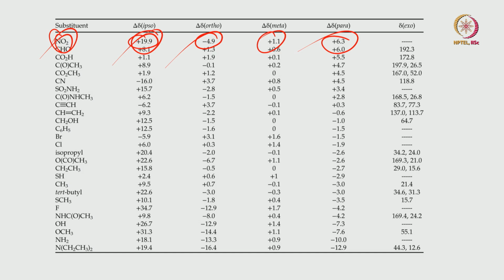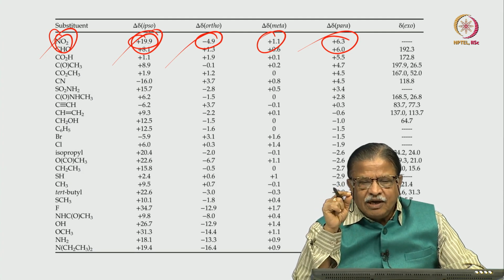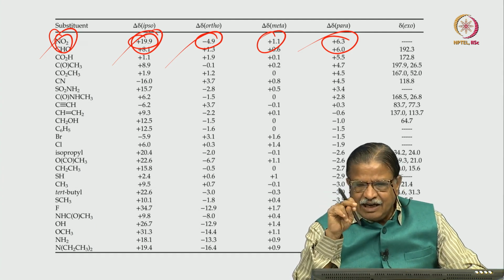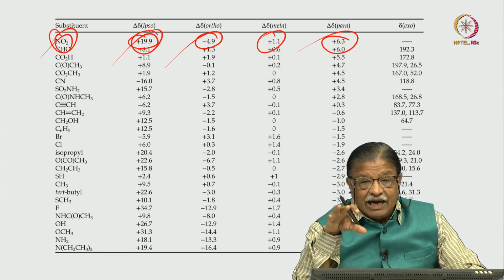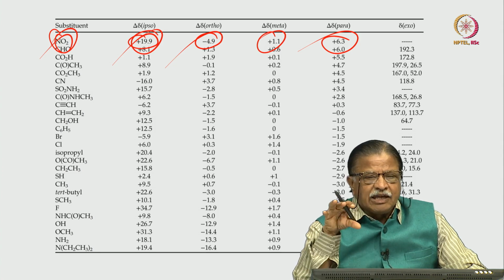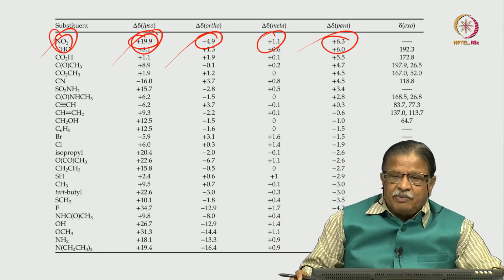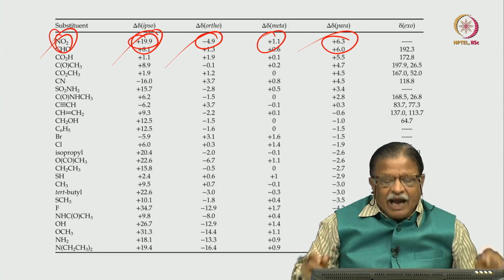In the example of analysis of proton spectra, I took 2 or 3 examples and showed you based on the substitution of NO2. First I took the example of dinitrobenzene, where each proton has one ortho and one meta nitro, and I added that value and showed you the basic value for proton chemical shift of benzene. You have to take 7.28 and then add the substituent value to arrive at the approximate predicted chemical shift for protons of the phenyl ring.